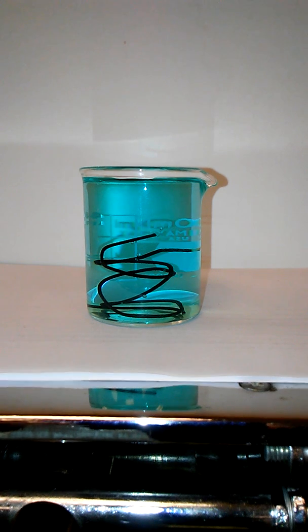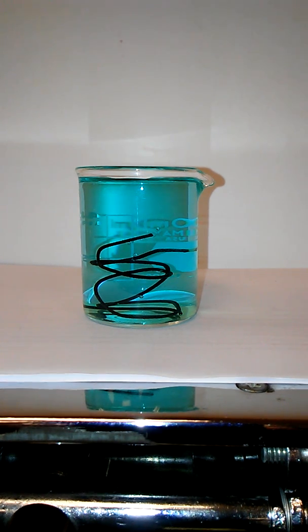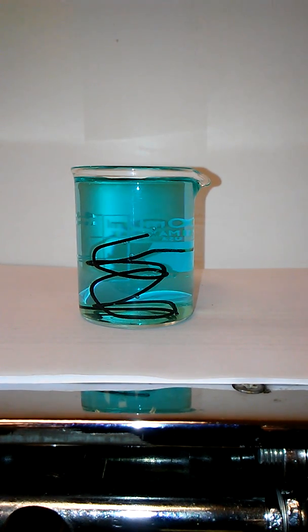Again, you're only accountable for recording observations of this one. And here in a few minutes, as the period ends, if you want to come by and take a look at it, just be careful not to bump the setup. Feel free to do so and take a look at the copper coating there on the iron wire. As I said, over time it will get thicker and thicker and thicker. And hopefully we'll be able to see more evidence of that on Monday.